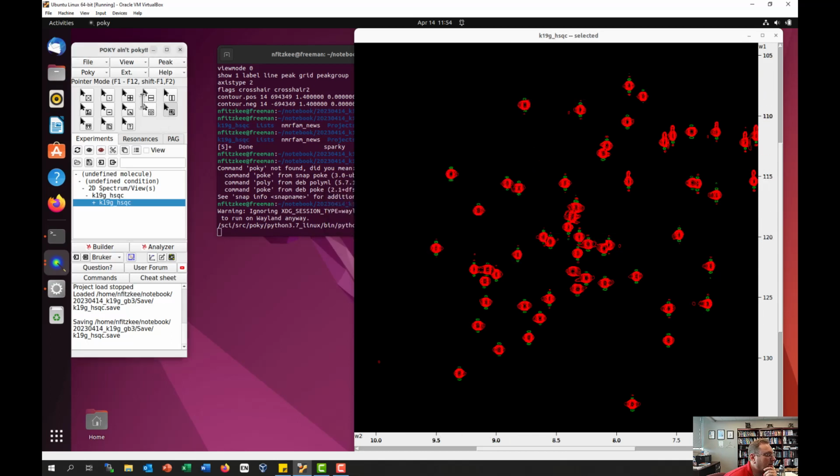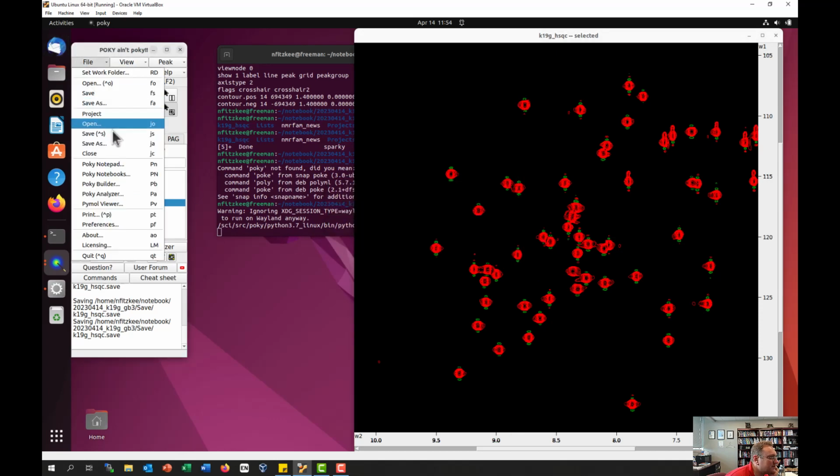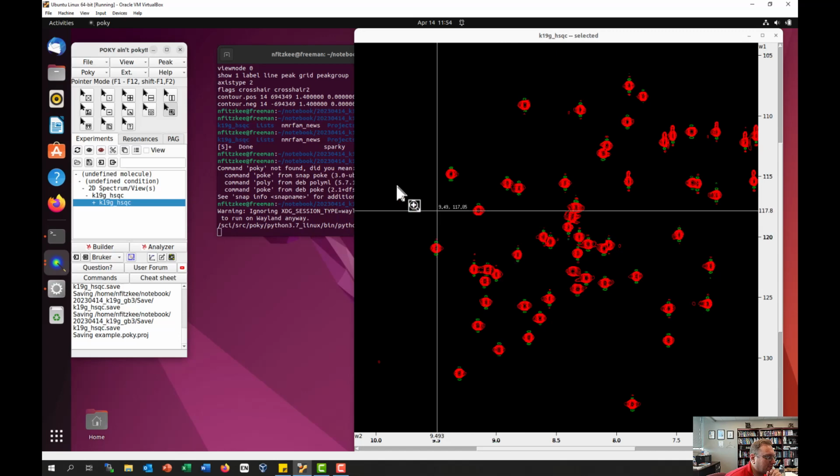Okay. But notice again, if I'm in here and I type JS, it's giving me the same things. Now let's do File, Save As. That's new. It might just be in a weird space looking for folders. Again, I think when I've tried this down on your lab laptops, everything has worked.